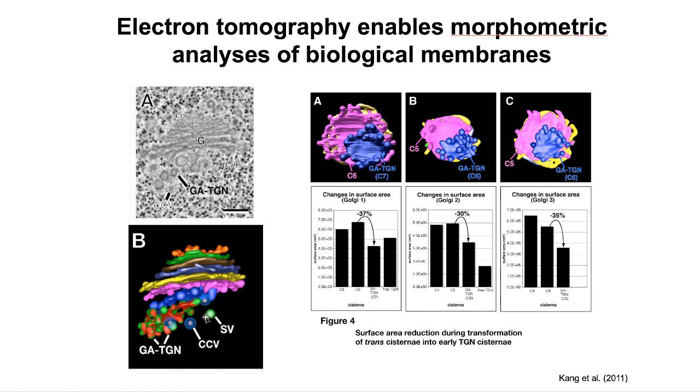Since the secretory vesicle does not have a very obvious coat, such as clathrin coated vesicles, it is difficult to tell where the vesicles are budding out. So this is one way to identify candidate areas where secretory vesicles are budding from the trans-Golgi network.